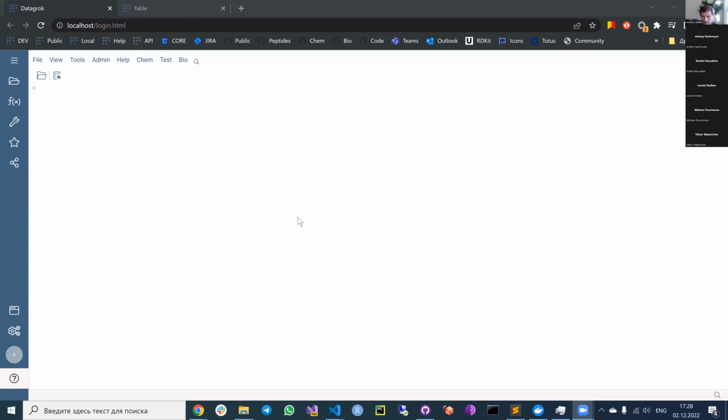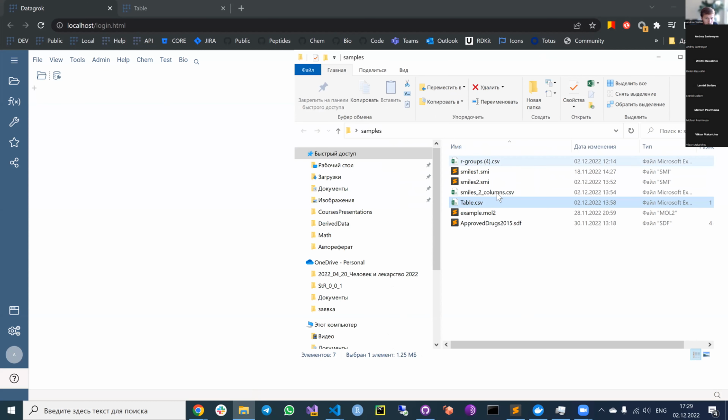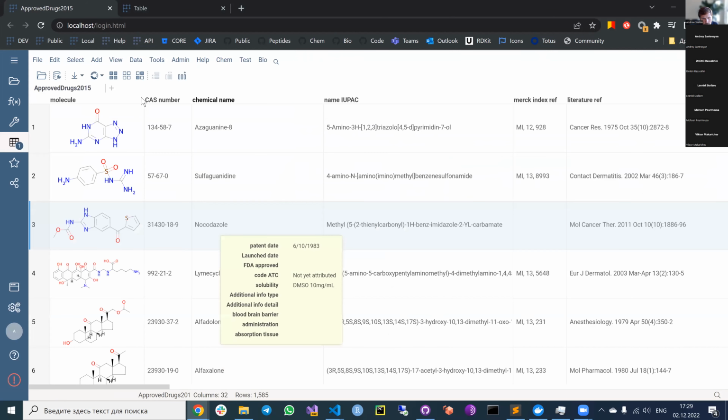Yes. All right, so we are now focused on chemical structures, notation consistency, and covering new chemical file formats. And to demonstrate it, let's see the data set containing mol v3000 file notations.